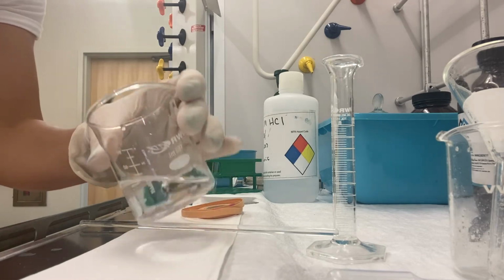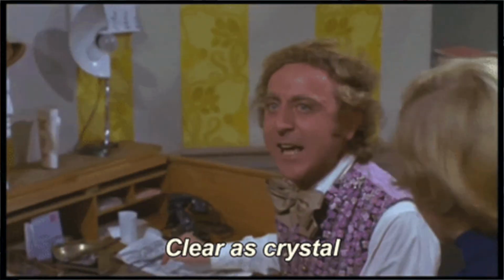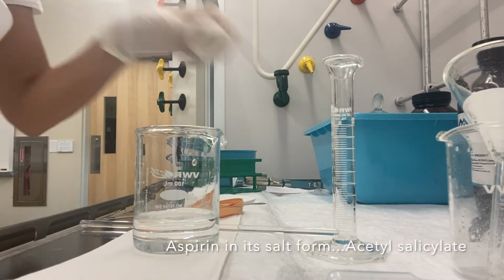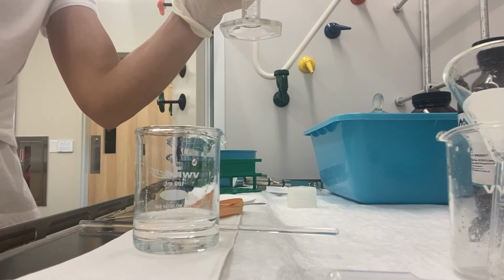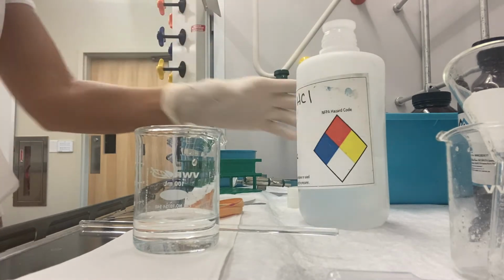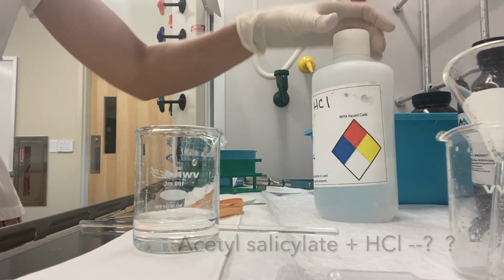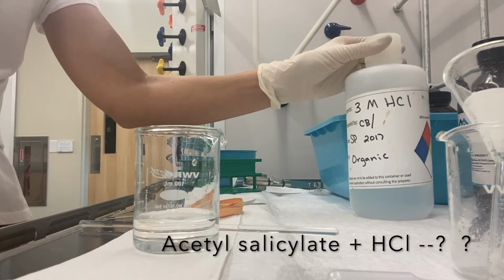So I've just finished filtering off that impurity by gravity filtration. So now we have our nice clear solution here that has our aspirin product. And it's a basic solution. Remember, we added that 5% sodium bicarbonate. So we want to reprotonate our carboxylate and get our neutral aspirin back. So we need an acid, and we're going to use 3 molar hydrochloric acid for this.